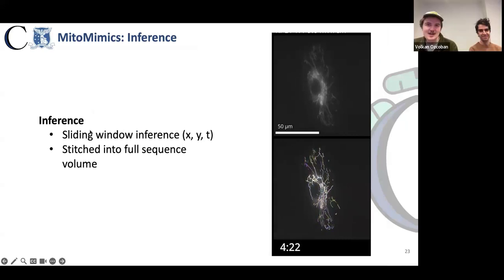As the model is just a 3D model at its core, inference for longer durations or bigger samples is as simple as turning real time lapses into big volumes and using the nnU-Net framework U-Mamba is built onto to do the rest.